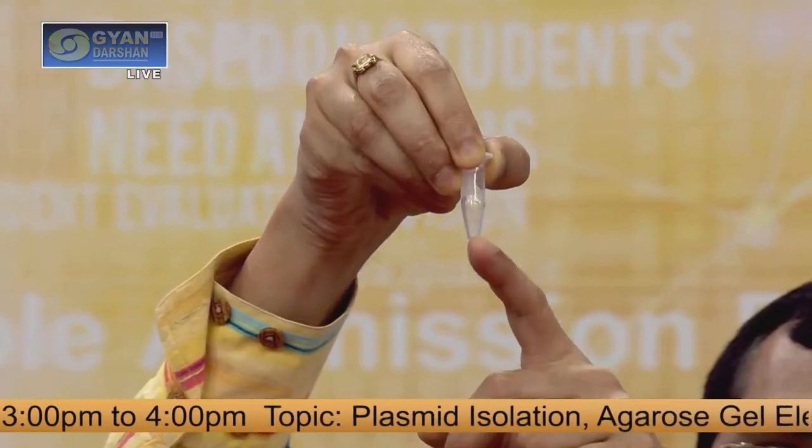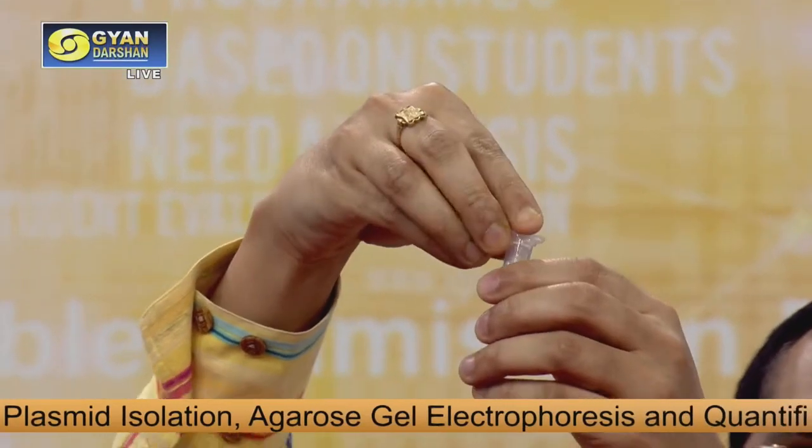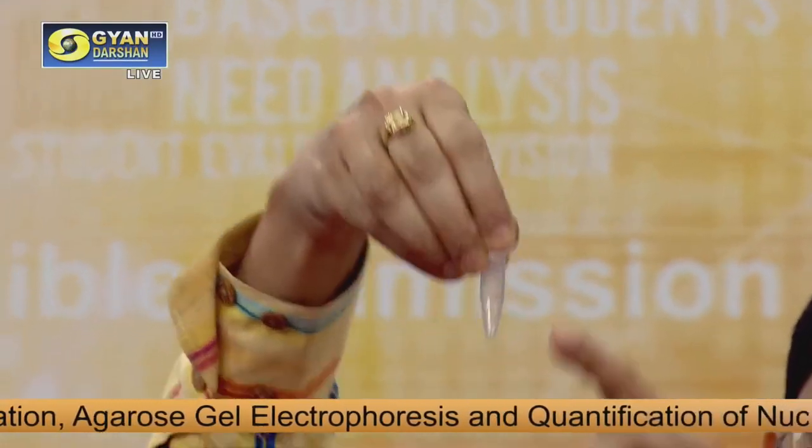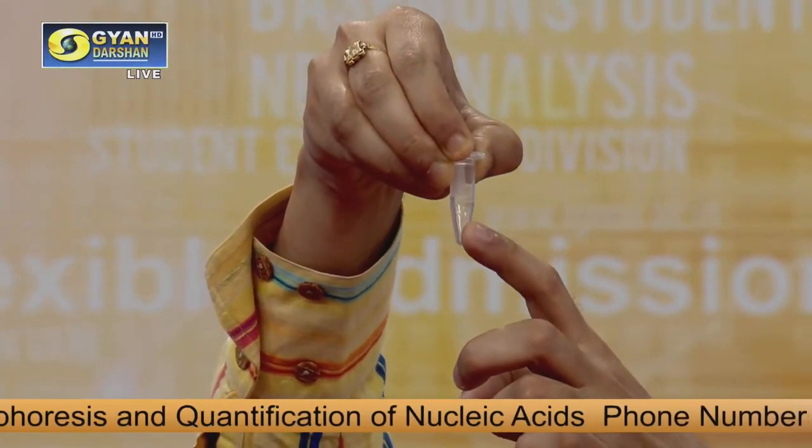After centrifugation, what you will notice is that you will get a bacterial pellet. Where will be the pellet? The pellet will settle at the bottom of the tube, like here somewhere. If you place the tube this way, then it will be on the back side. Here you will observe a pellet.